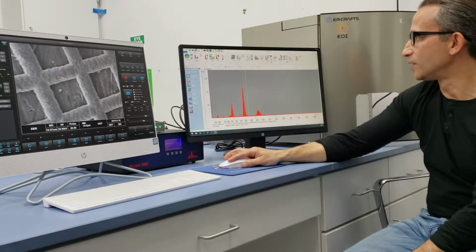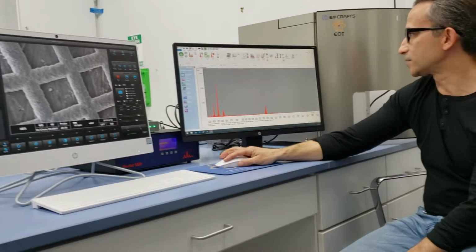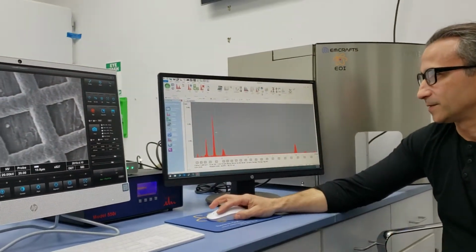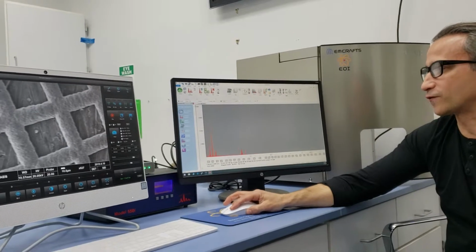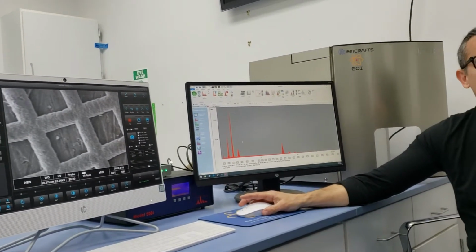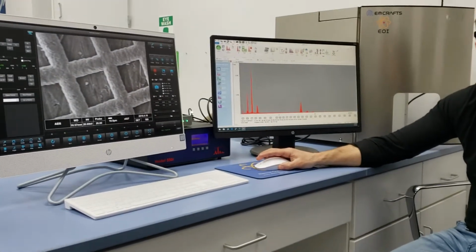Or you can go up, down, shrink, separate. But using your mouse and the cursor is very, very quick, and this is the way I normally do it, but I can't tell you guys how to do this thing. There's a lot of different features. But right now, all I'm doing is going over this flowchart system.